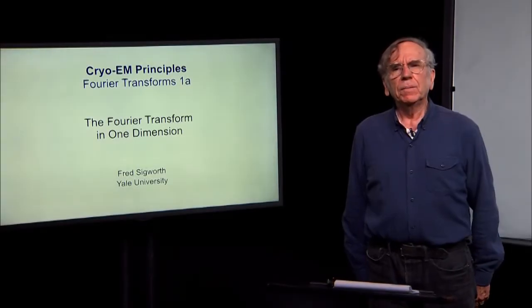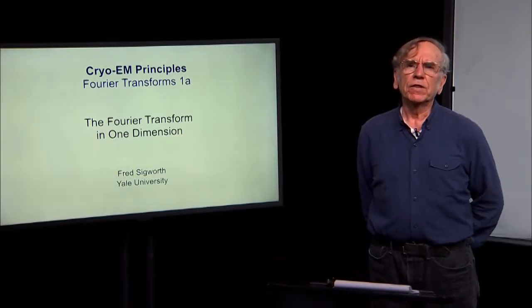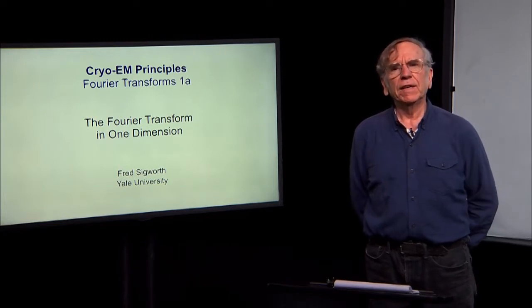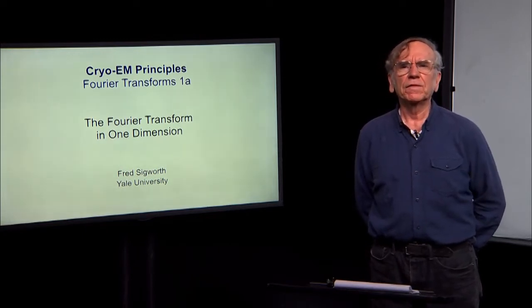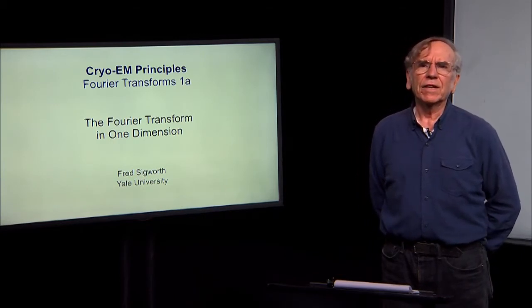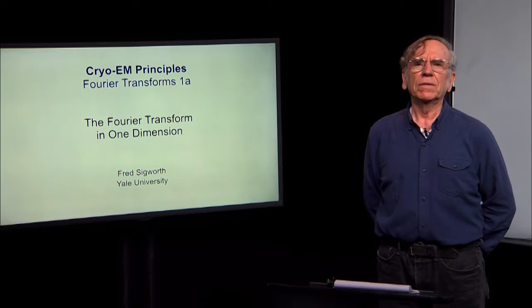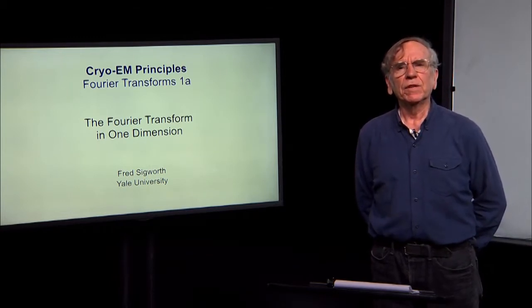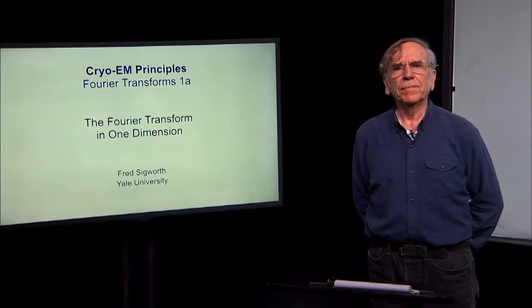Last time we worked out the contrast transfer function for a sinusoidal grating, and I promised you that if we know the transfer function for sinusoidal gratings, we can get the transfer function for any sort of image. Well, that's a 2D problem, but today we're going to do the simpler 1D problem first.